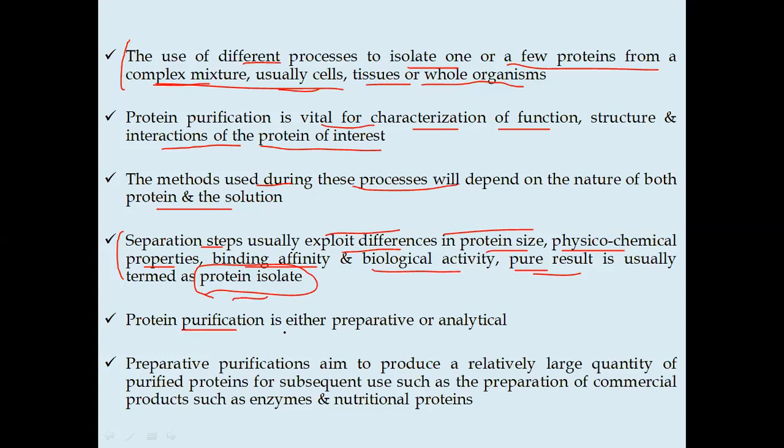Protein purification is either preparative or analytical. Preparative purification aims to produce a relatively large quantity of purified proteins for subsequent use, such as preparation of commercial products such as enzymes and nutritional proteins. So preparative purification processes produce large quantities of purified proteins.